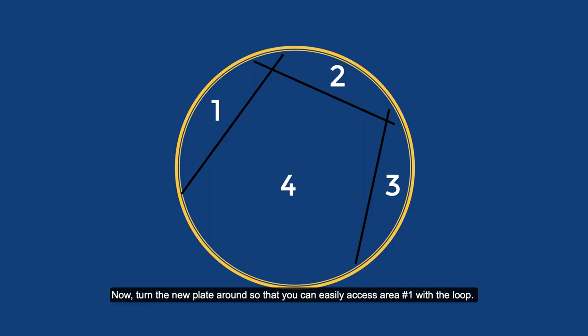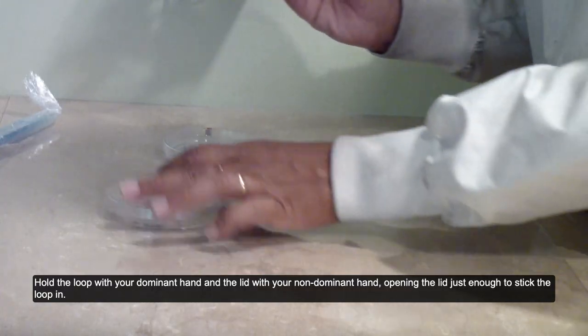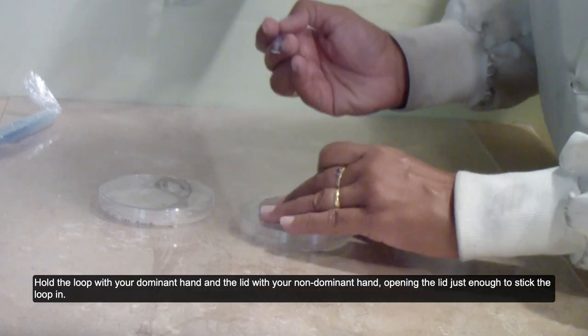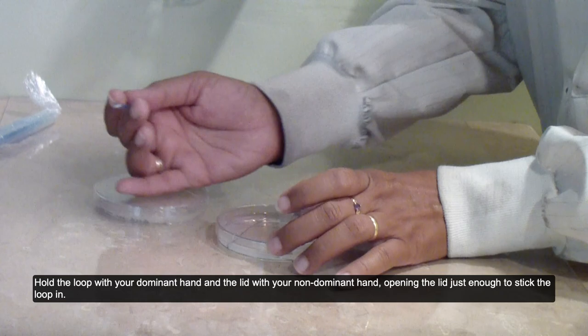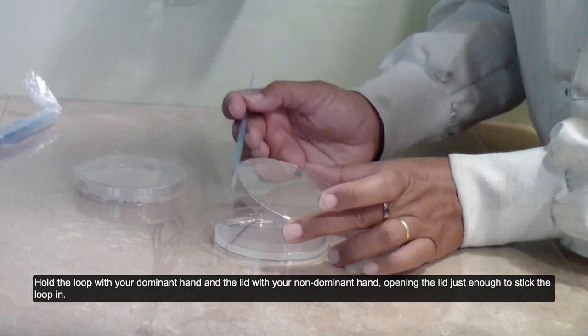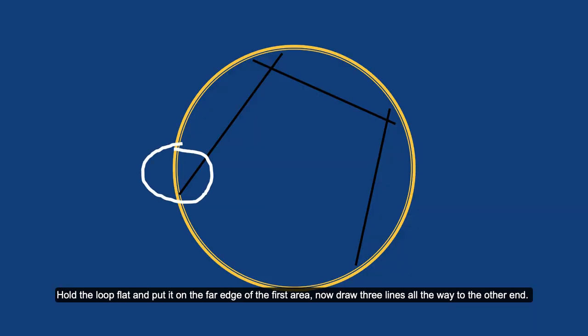Now, turn the new plate around so that you can easily access area number one with the loop. Hold the loop with your dominant hand and the lid with your non-dominant hand, opening the lid just enough to stick the loop in. Hold the loop flat and put it on the far edge of the first area. Now draw three lines all the way to the other end.